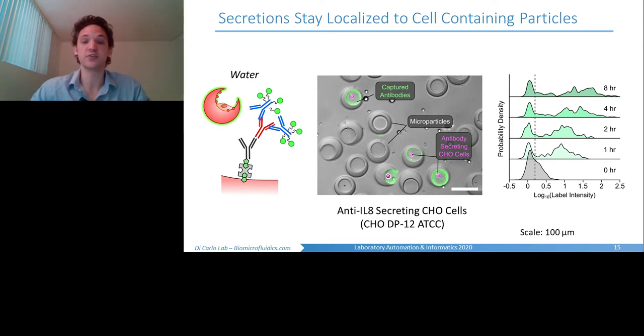But two, it's also very interesting in that we see that it's not a single peak. It's not a very sharp peak. We see a very large distribution in the productivity of these cells, which is supposed to be a cell line, indicating that there is a lot of functional variability in these cells.